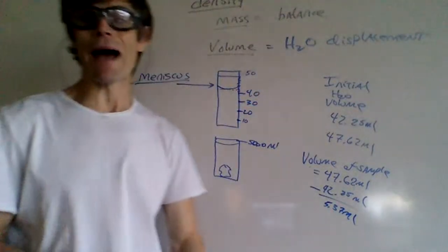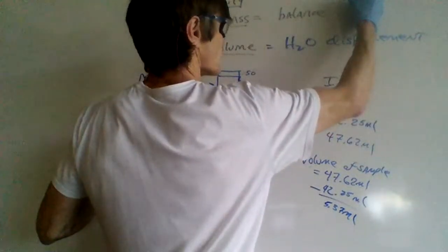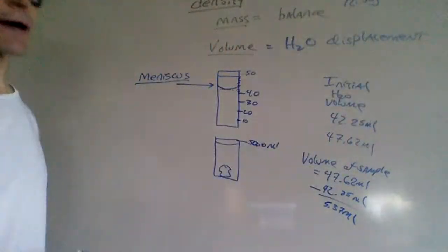And what if we weighed its mass? And we got a mass of 12.35 grams.